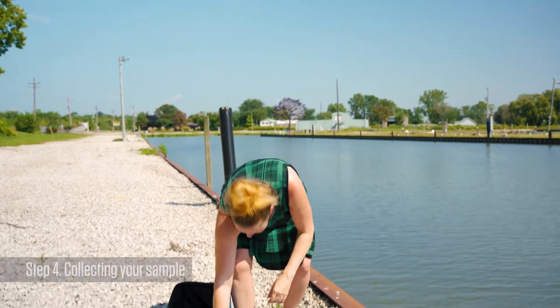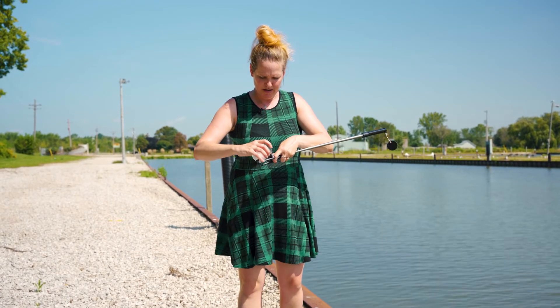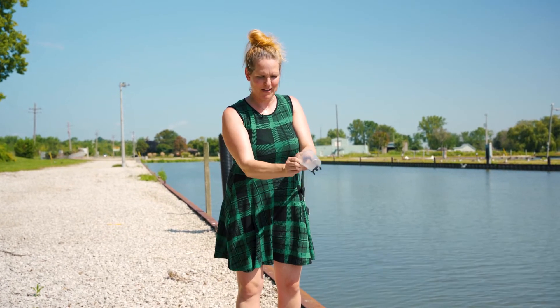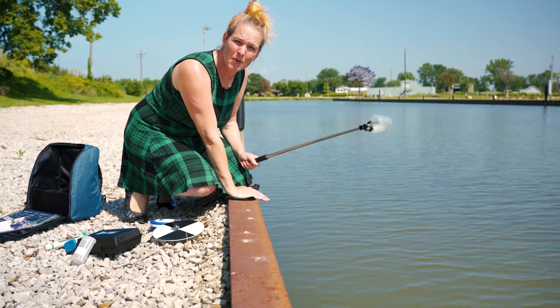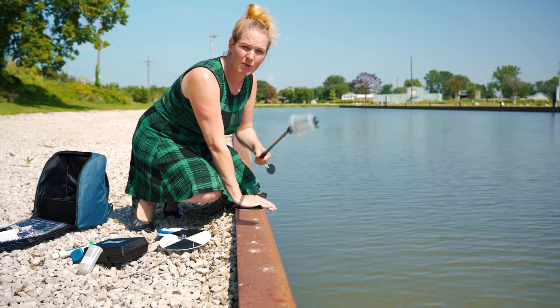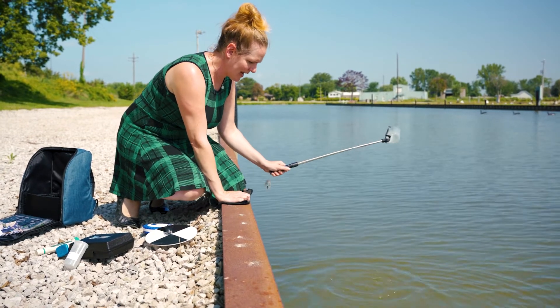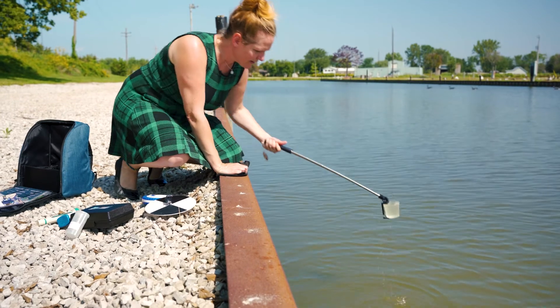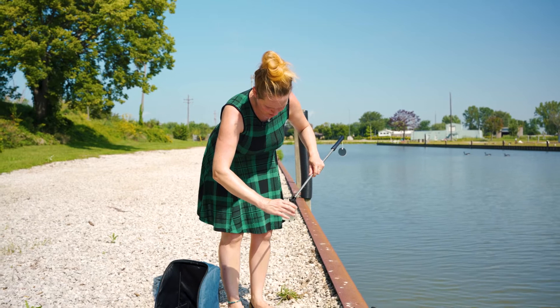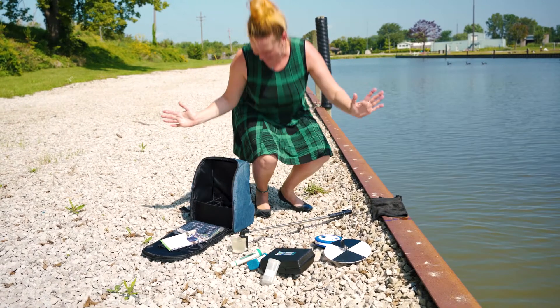Now we're ready to do our water test. We're going to get our reacher stick, extend it, and attach our sample cup like so, then tighten the little knob. We're going to use it to reach down into the water. It's really important that you rinse your cup three times in the water you'll be testing — it gets rid of any residue from your last test or from your hands. Now we're going to take our sample about 15 centimeters below the surface.